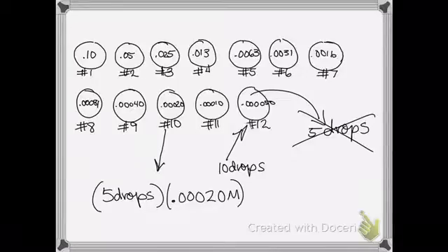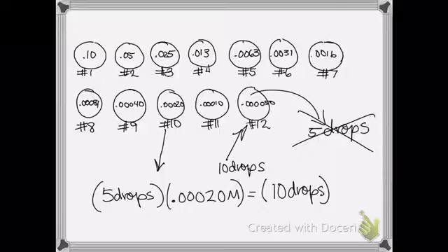All right, so remember, you've taken 5 drops out of each one of these well plates. There's 5 drops remaining. So you are going to be adding an additional 5 drops to the 5 drops that are already in there, which gives a total of 10 drops in each of these with the sodium hydroxide in it. Okay, you've added 5 drops of sodium hydroxide to each of these well plates.